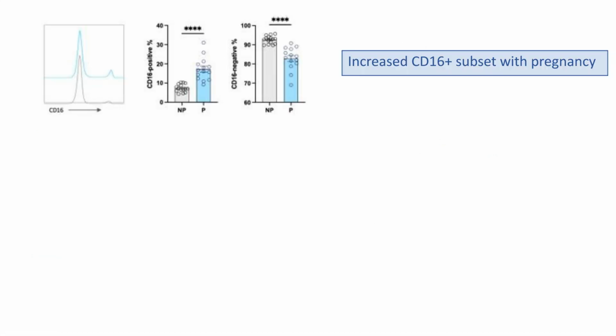So the first one is just, I don't want to say straightforward, simple flow cytometry. I love flow cytometry. It's a great tool. It's one of the key tools that we use in my laboratory, but we can do lots of powerful things. Of course, we can do this in our whole blood, and I've already given you an example, and we can do it on our mononuclear cells, but because we're ultimately interested in potentially subsetting these based on their CD16 expression, we've gone with using our purified monocytes for much of this analysis.